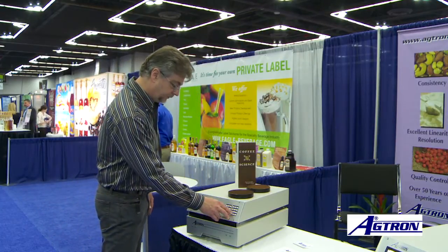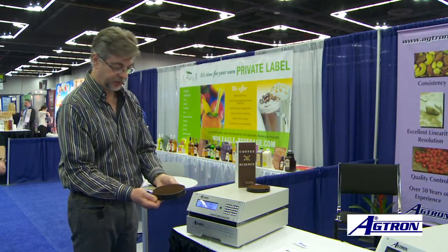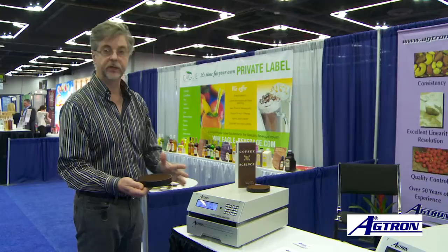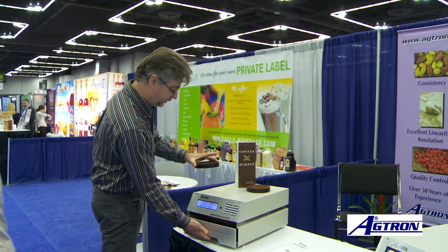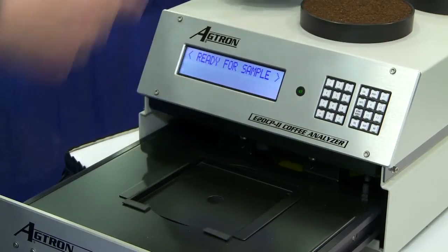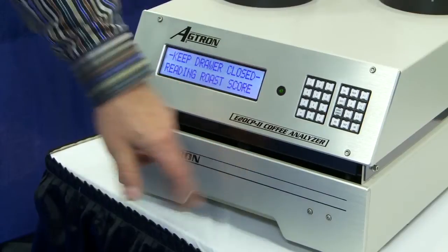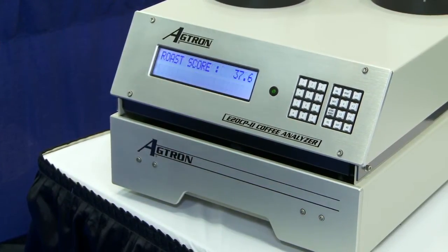Once that's finished, then I can introduce the standards or the samples to be evaluated. These are ground samples, and we use a straight edge to make a flat conformal surface. This is a good representation, an average representation of the chemistry in the coffee. We're looking at a very large area as well. This is really important. It gives us a better idea of what the roast development is. The analyzer is taking the measurements right now using 3 specific wavelengths of near infrared, and it comes up with a score.